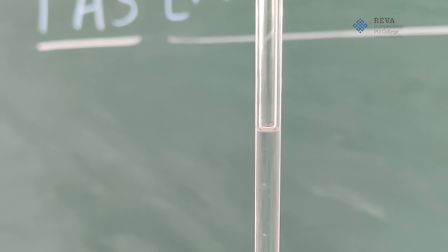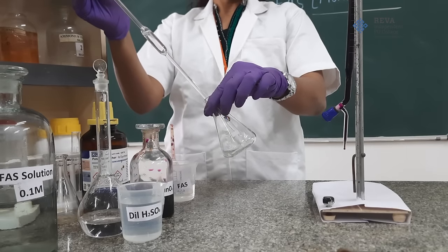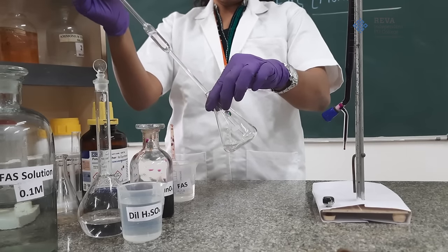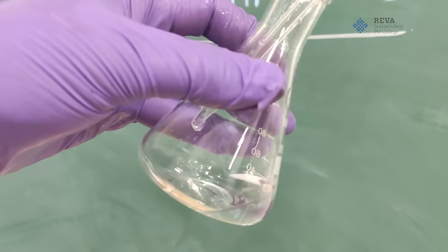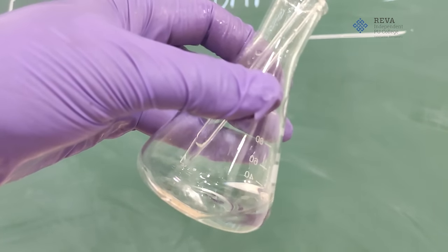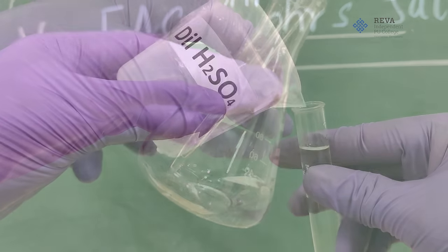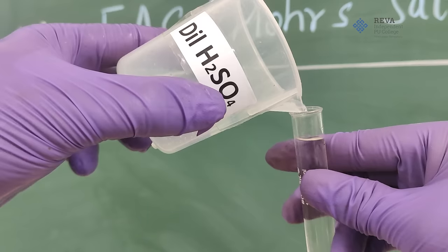Since ferrous ammonium sulfate is a colorless solution, look for lower meniscus. Now transfer the solution into a clean conical flask. At the last, if any solution is left out in the pipette, tap the bottom of a conical flask using your pipette thrice or four times.